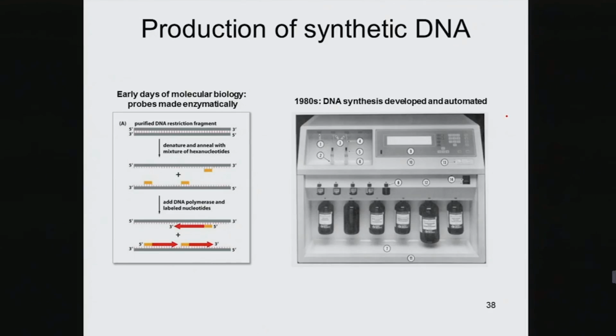So I'm basically going to go over the procedure of how we replicate DNA, which Dr. Brown will get into more detail. So hopefully you have some idea. We have our double-stranded DNA. Typically, you will need to denature the double-stranded DNA so that you free up a template for the DNA polymerase. We're going to add in some primers, and we need primers for DNA replication because it cannot start without a free 3' hydroxyl. Our primers will bind to the template and also to the non-template strands.